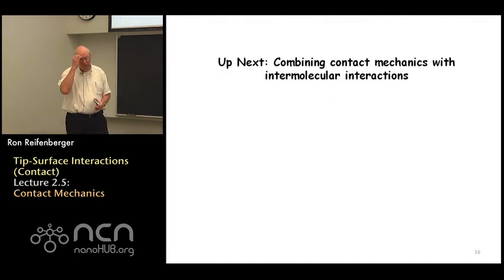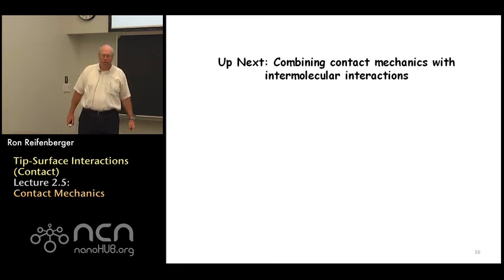So I think we're going to sum up by just saying that the next lecture will move us into combining these contact mechanics with intermolecular interactions. It'll start to move us into calculating or simulating the interaction forces that result when you push on a sample with a tip of specified radius. When we discuss this material, we'll get a much better sense of how these different contact mechanics models can be incorporated to describe atomic force microscope experiments in some detail. So come on back and we'll discuss that in the next lecture.